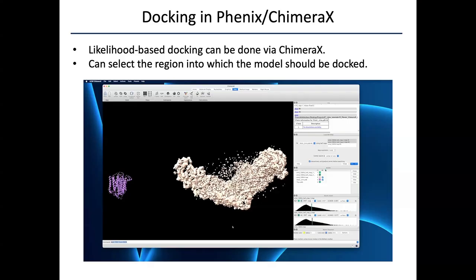My question was related to this because when you were explaining the docking process, I'm a crystallographer by training. So when you were talking about docking, it immediately resembled, in my memory, the molecular replacement process that we do in crystallography. And you spoke about the likelihood. So I think there are some similarities in those methods, right?